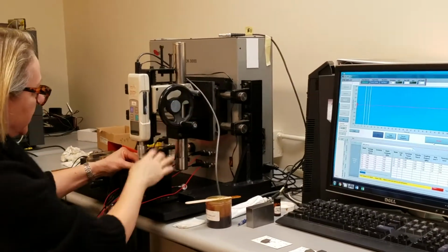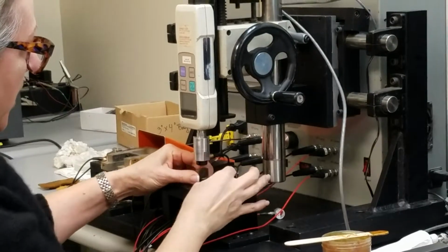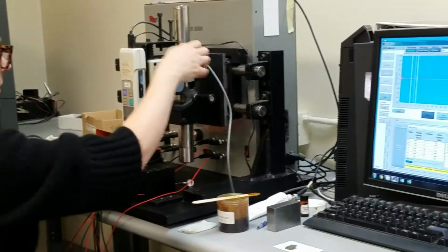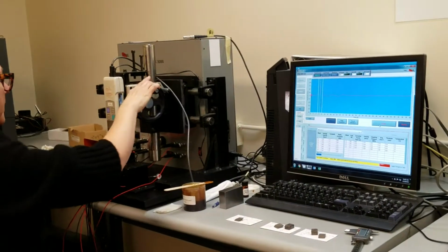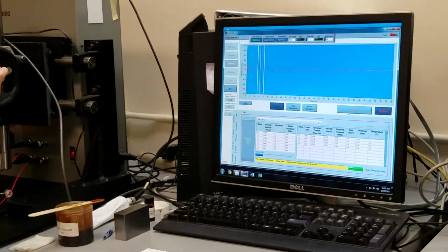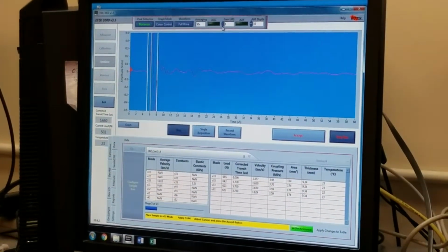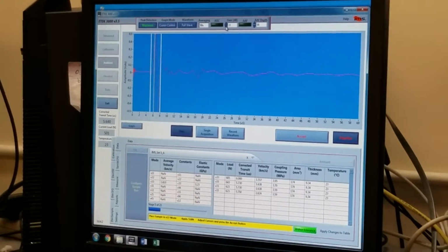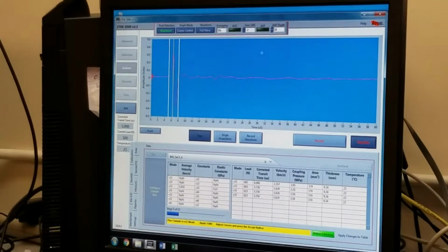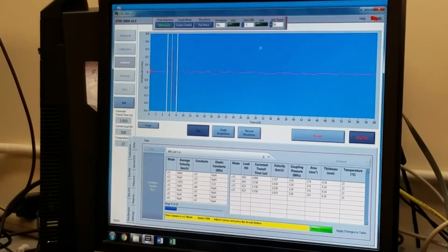I will raise my sensors and orient the sample so that it is sitting on its side so that the sound wave is going to travel through the two direction. And the prompt says 518 newtons. Again, the friction material is not load dependent in this direction, but for consistency's sake, we will apply the same coupling pressure of 4 megapascals.